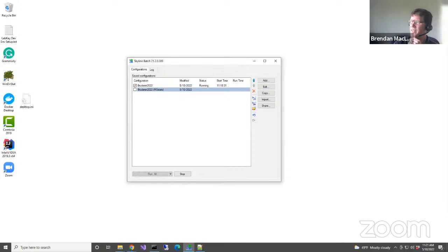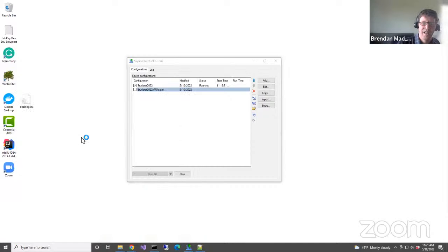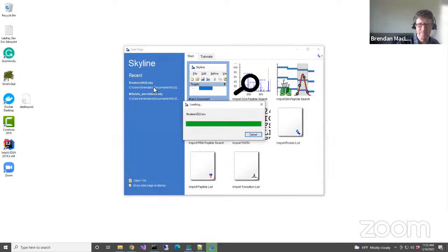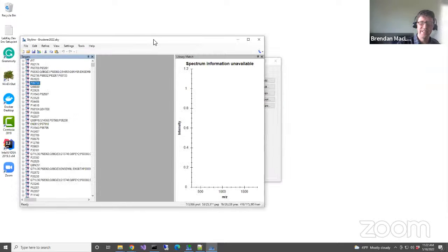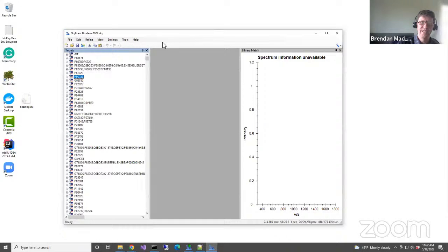Okay, so yeah, any settings that need to be taken care of to acquire DIA with MS? Yeah, so we didn't do anything. Even while this is processing, I can go to Skyline and start another instance of Skyline. It may be slower because this machine is actually doing a lot of work at this point. But if I open this up, this is my template file. And one of the ways I could have set my template file up, but chose not to. In this teaching setting, I was choosing settings that gave me a smaller document, 175,000 transitions. Certainly I processed documents with over 1 million transitions. But in the teaching setting, it's better to choose small because it processes more quickly.